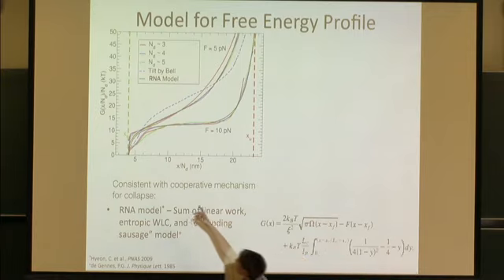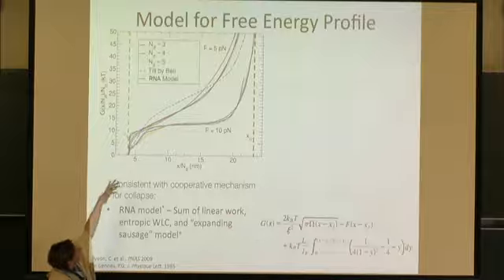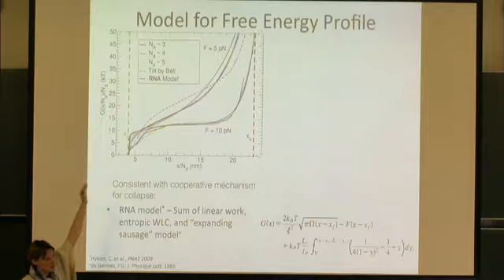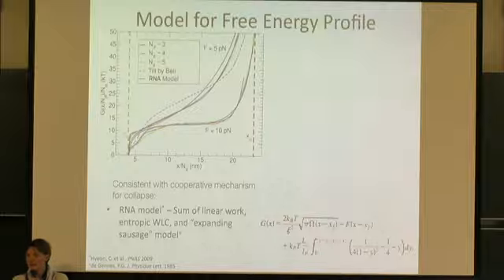It's a good fit, but actually we lie a little bit, because if you look at the black one, it's consistently sharper than the data. The way it's drawn, it looks better than if you zoomed into that last leg. And I think that's because it's not as cooperative as the physical model would predict. It's something more consecutive, that there is a sequence that matters. That's when it's fast. Yes, the estimator is the poorest there too, because it's really fast, so there are very few data points.